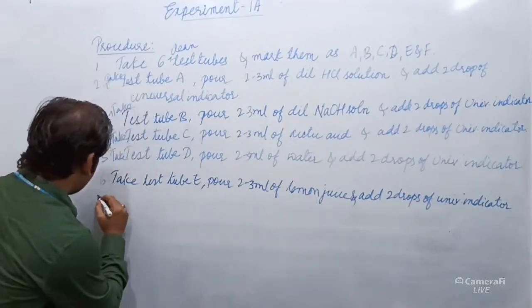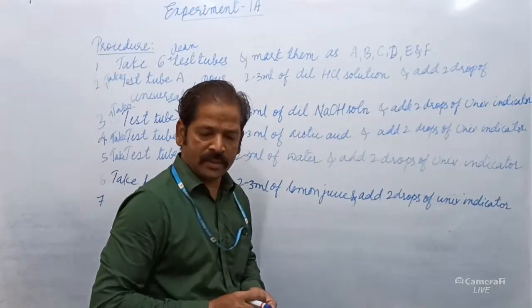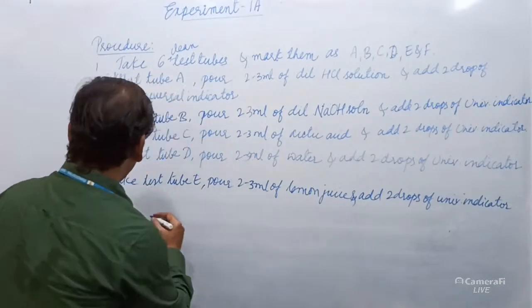And the last chemical is sodium bicarbonate solution.